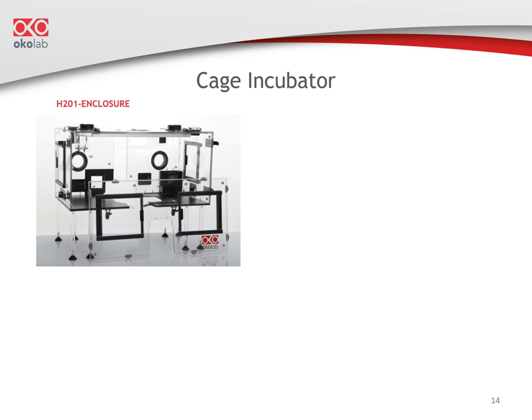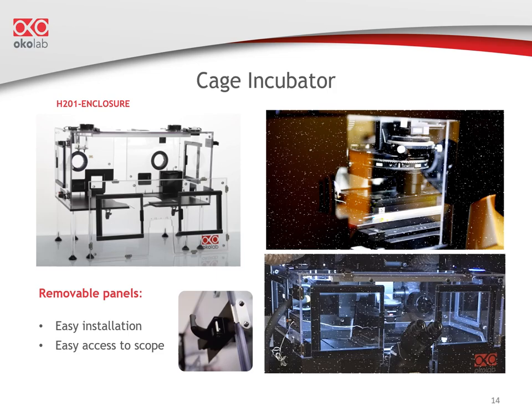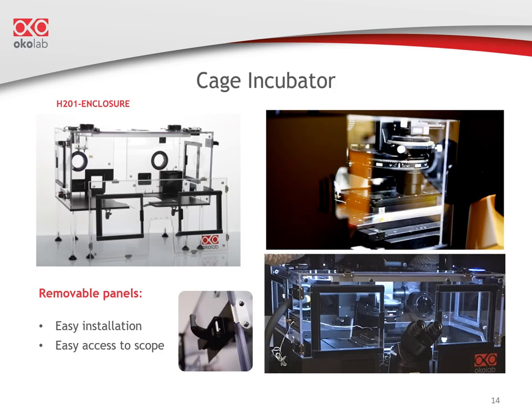The enclosure is easy to install, as the panels are held in place by hinged clips. To fully access the microscope, simply remove the front panel. OkoLab enclosures come with a standard LED light operated with a foot pedal, providing a clear view as you set up your time-lapse experiment.